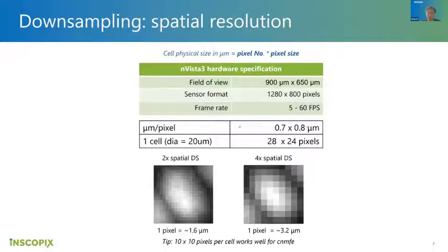And the reason you sometimes want to do downsampling, turning your retina display into a garbage display, is really just to save file size and make it easier to do further processing. The point is really just to reduce the pixel number and increase the pixel size, so each pixel would be larger.